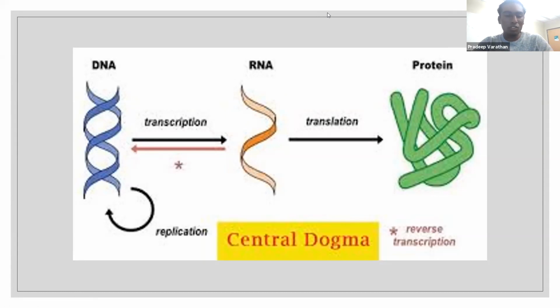So let me just stop sharing a bit, and I'm going to share my Colab file with you. Feel free to go to the file option and copy it to your own drive rather than editing it in my Colab notebook directly. So let me copy the link, and I'm going to put it in the chat. I hope everyone has access to it. Just let me know if you do not.